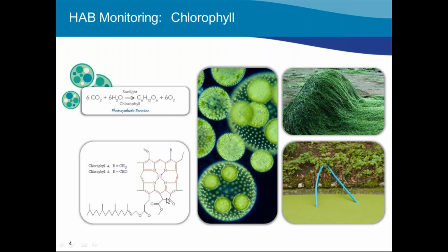So the molecule itself, chlorophyll, I've shown here, not because I necessarily expected you to recognize it, but if there are any biochemists in the audience, you might recognize the potential here with all these double bonds for this to be a fluorescent molecule. And in fact it is.